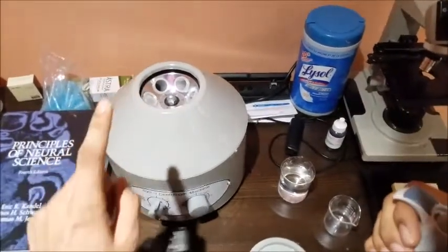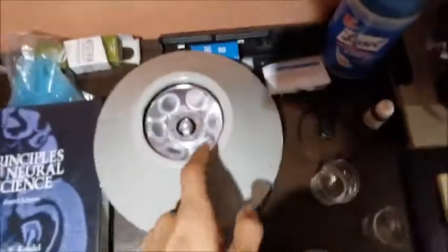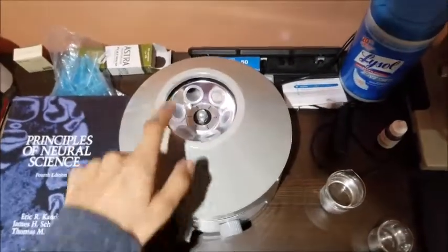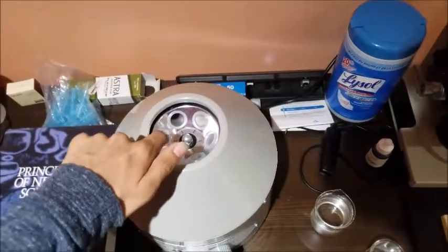It's very, very important that you balance your tubes. So if I put this in tube number one, then I have to put an equal quantity into tube number four, which is the opposite tube. Otherwise the centrifuge will vibrate excessively, which is not very safe and can also damage the centrifuge.